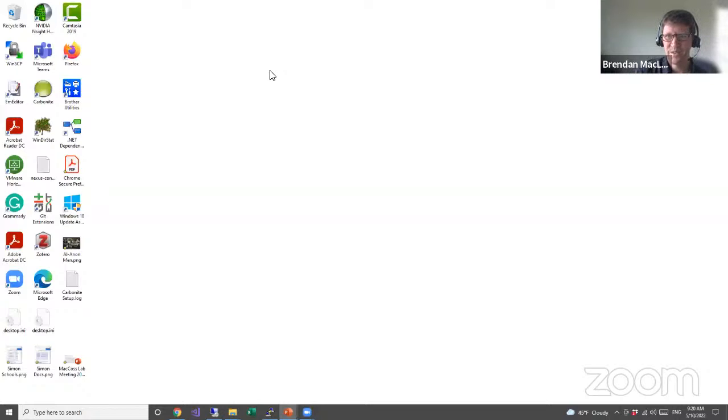So this is saying that I guess the retention times didn't move around more than a minute. And that was not, yesterday's data was not retention time aligned. So I think it was simply that our instrument operator, Daniela Tomazella, did a really nice job of collecting those 42 runs over, I forget what, 2 to 4 days of acquisition. But yeah, the retention times did not vary greatly.